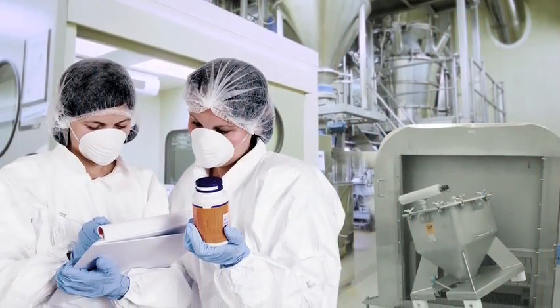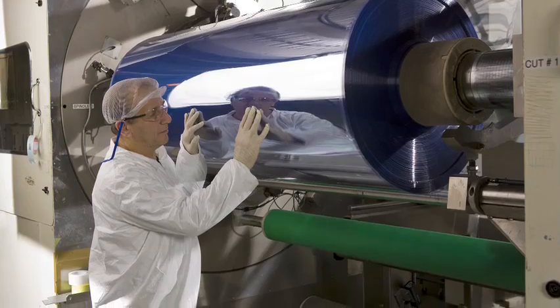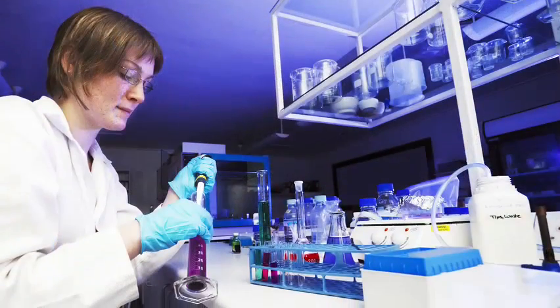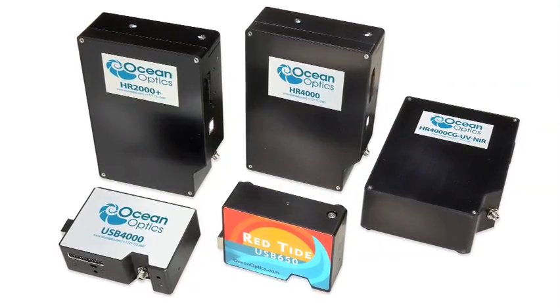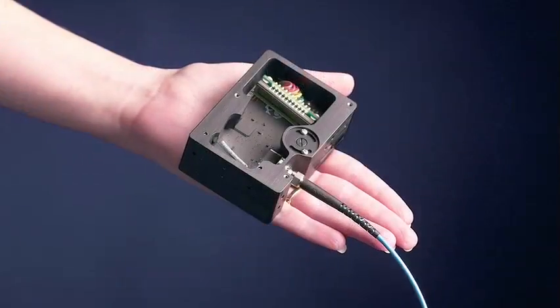OceanOptics provides reliable, customized answers in virtually any pricing requirement. For those with rapid product development cycles, OceanOptics provides optical sensing products with proven performance that are smaller, more flexible, and more cost-effective than any of our competitors.